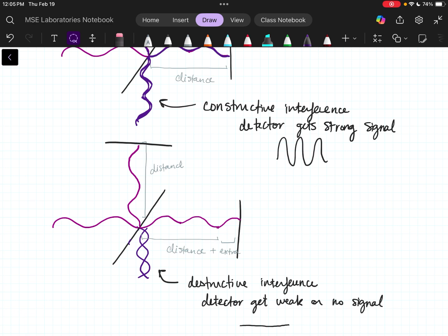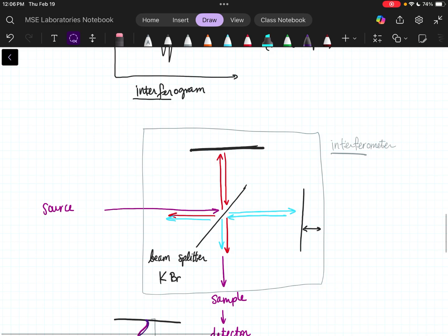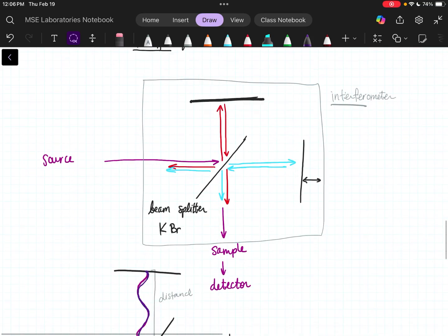How many mirrors can you use? Mirrors. We use 2 mirrors in an interferometer. There are additional mirrors outside of all of this to direct the light to where we want it to be. But in the interferometer, we just have 2 directions. The light can either pass through the beam splitter or bounce off the beam splitter. So we have a mirror in each of those 2 directions.